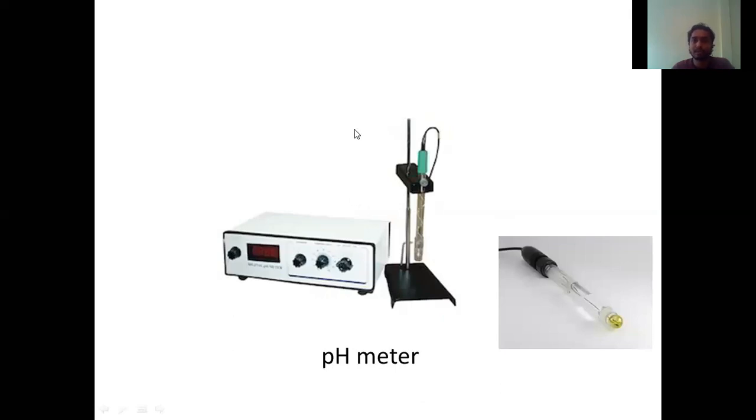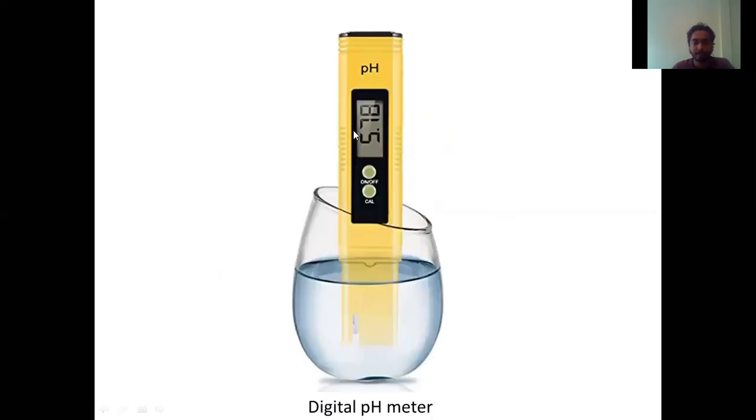As far as laboratory experiments are concerned, we mostly use the lab pH meter because it gives the most reliable values. If you use this digital pH meter to calculate pH roughly — say it shows 5.78 — it doesn't mean the pH of that particular sample is exactly 5.78. It might go to 5.6, 5.5, or even 6. You can't totally rely on this. But for domestic purposes or when we don't require an exact pH, we can use this digital pH meter.